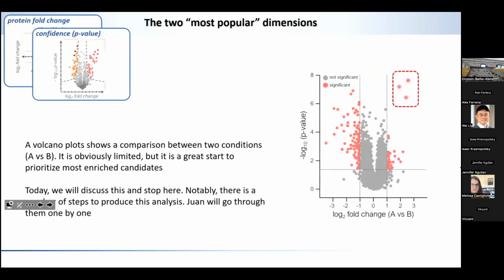And then obviously, you guys today are going to discuss fold changes and p-values, which are the other 2 dimensions that I quickly discussed. Now, this one is intuitive. I'm not going to spend that much time on it, but I promise you that by the end of the lecture, you will be able to produce those volcano plots that you can use to organize your tables, and you will be able to tell from an analysis which proteins are probably the most interesting for me.